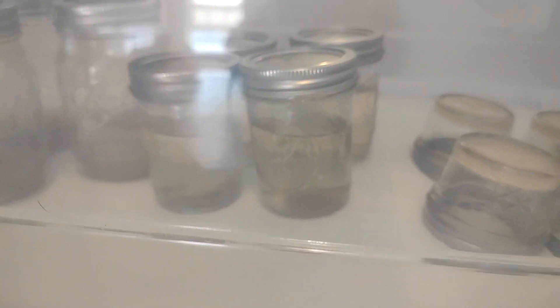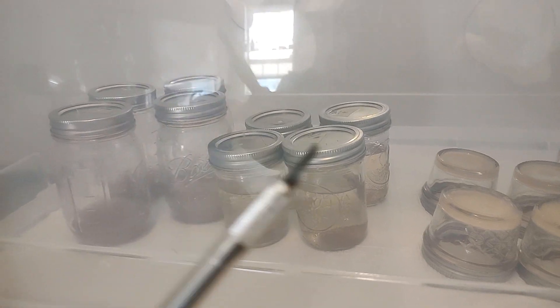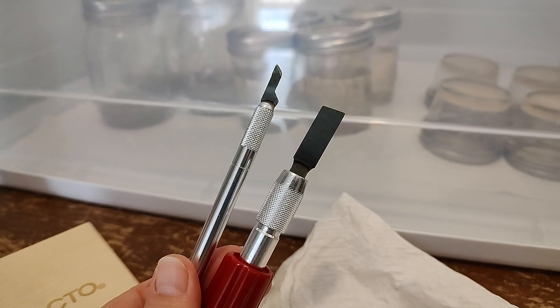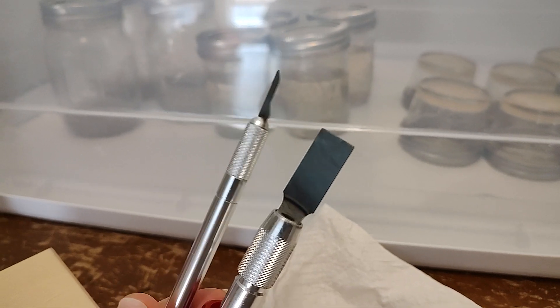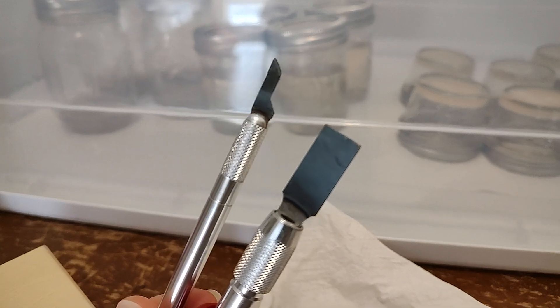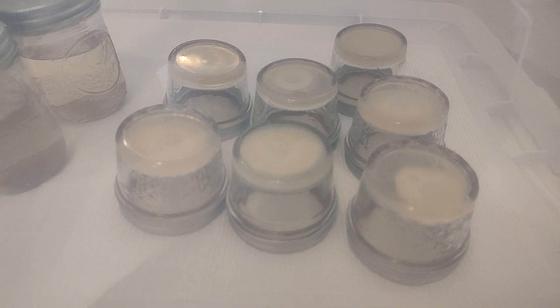With the LC — the liquid cultures — it doesn't matter, it's liquid, there's no agar in there, so I can just tap on the side. But I think it's easier to use a little spatula to help you get it off without causing a mess or it bouncing, because you really don't want the transfer to bounce on the agar plate. You want to get it right in the center. Some of mine are not in the center and that's okay, but it just makes it easier.